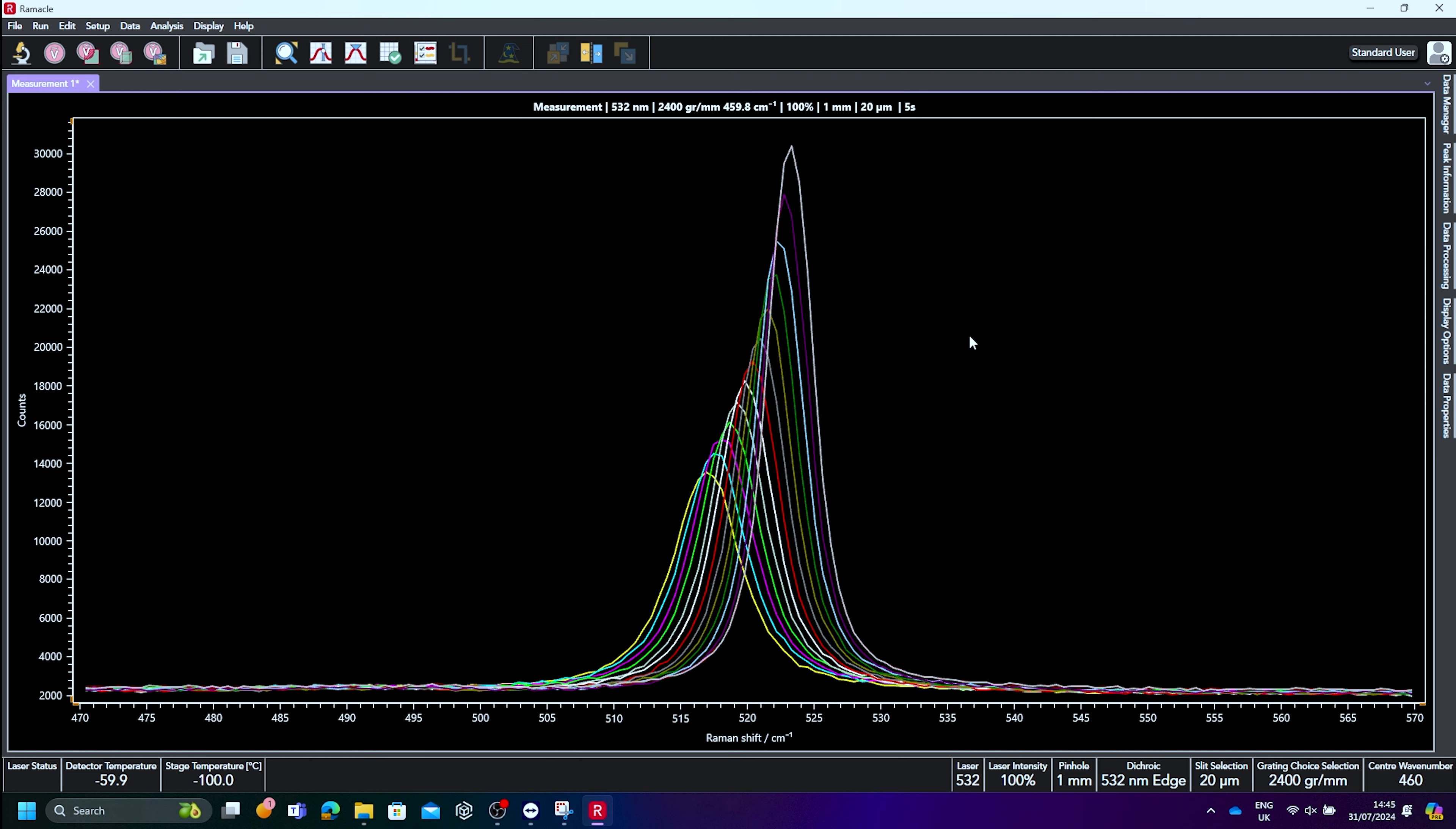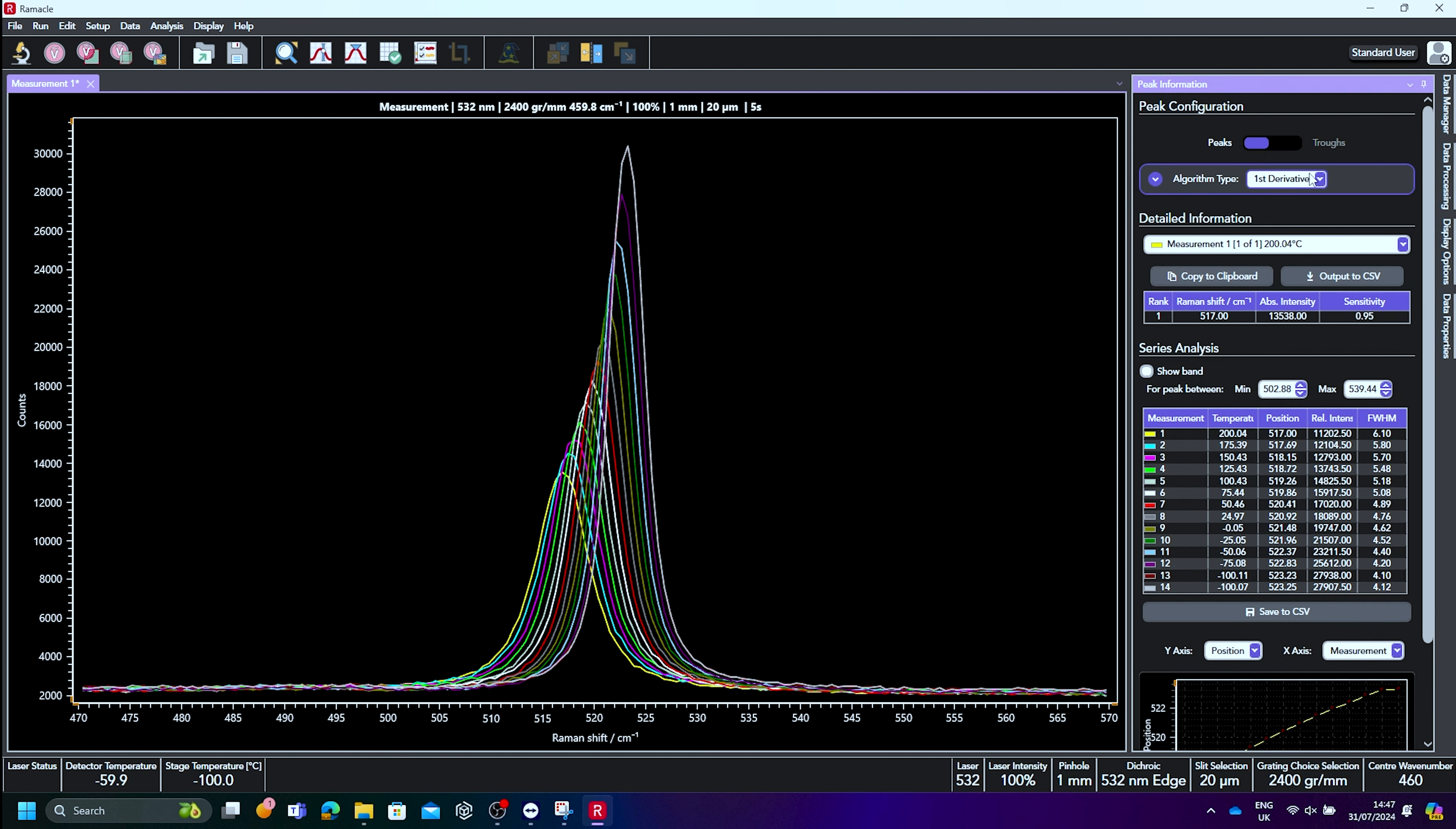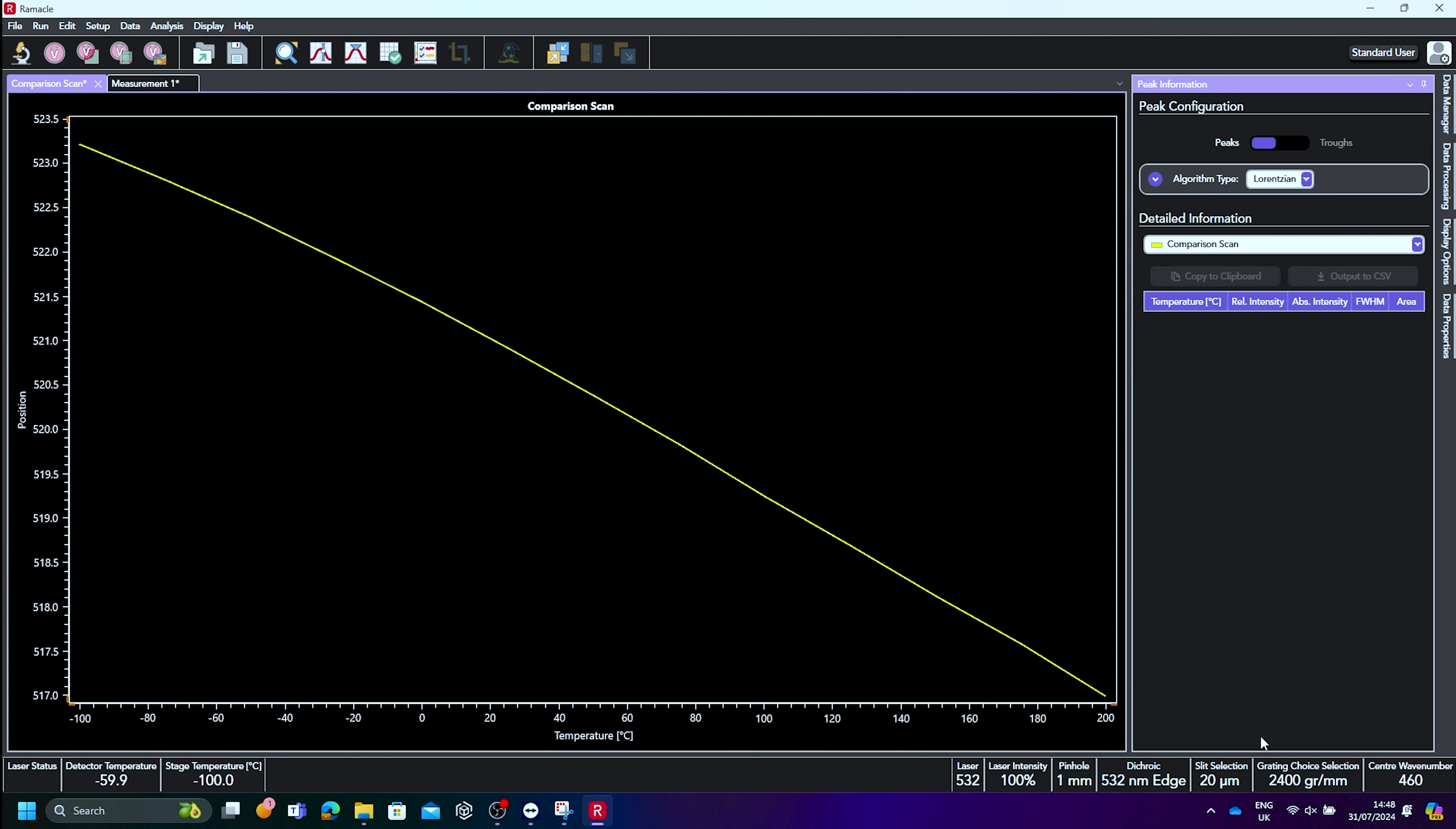We can now either export the resulting data, process it, or perform trend analyses showing how various spectral parameters change with temperature. To do the latter, select peak information, select show band and ensure that the white box on the spectrum is covering your band of interest, and set the x and y axes accordingly. This trend analysis can also be exported to show more clearly how your samples change with temperature.